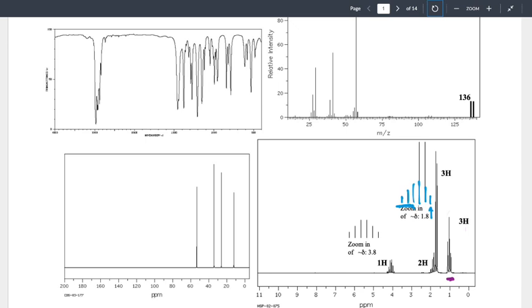What about red? What's going on in red? That one's super tiny to see. I have a CH3 next to a CH. Do I have a CH3 next to a CH? I do. So that is duplication with my orange one, except I have this extra CH2 I need to include. So what we've now done is removed some duplicates and simplified this. Are we ready to put it together yet?